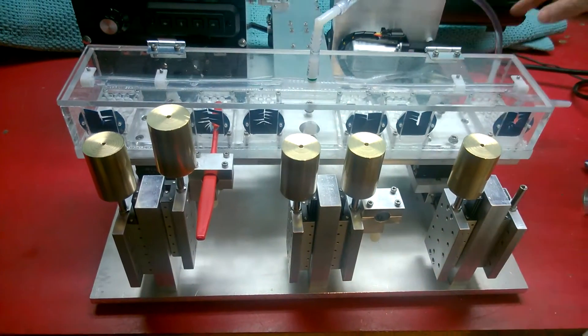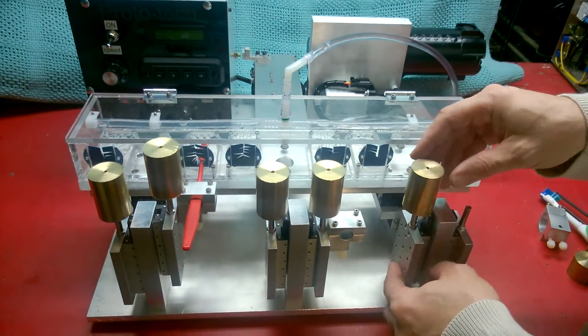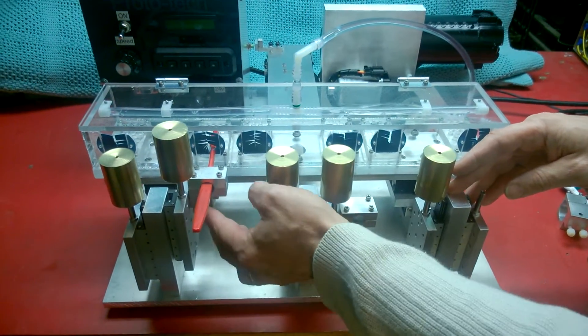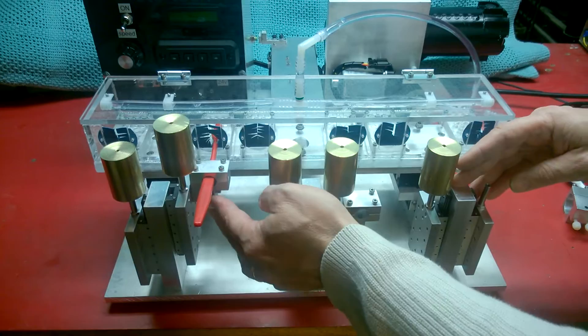It has a recirculating slurry system and the brushes are loaded with weights. They're held in individual clamps and on sliding guides.